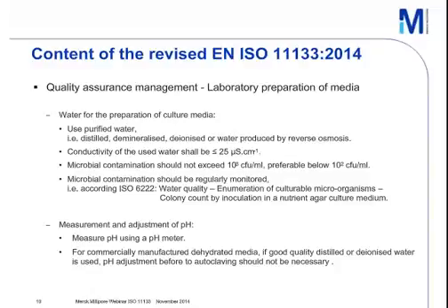The conductivity is specified in the standard: the water shall have a conductivity below or equal to 25 microsiemens per centimeter. And very important, the microbial contamination should not exceed 1000 CFU per milliliter, preferably below 100 CFU per milliliter. CFU is colony forming units.